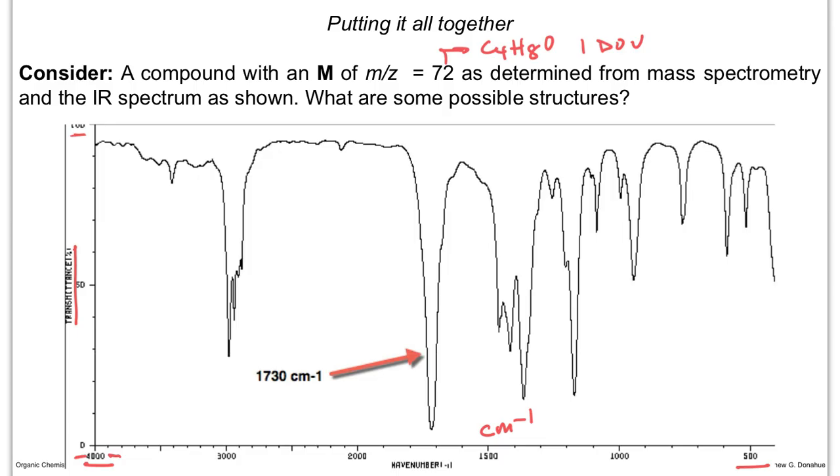You see the red dot? That's 100% transmittance. Now, when I put my hand in front of it, you don't see it on the wall anymore. If the wall is the detector, that's now 0% transmittance. Alternatively, this is 100% absorbance.